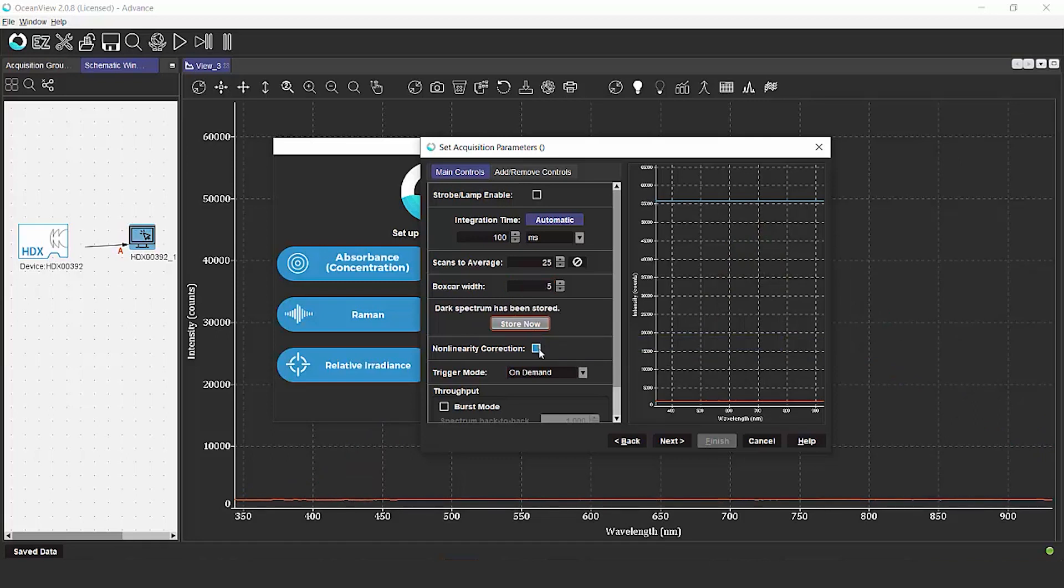Once you've collected your dark spectrum, the next step is to turn on linearity correction. We're just going to place a check in that check box, and that's going to give us the most linear data that we can get out of the spectrometer.